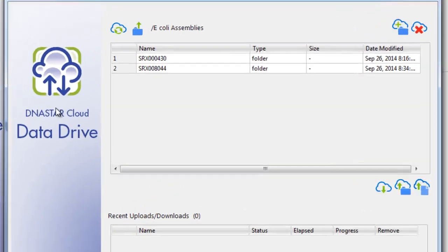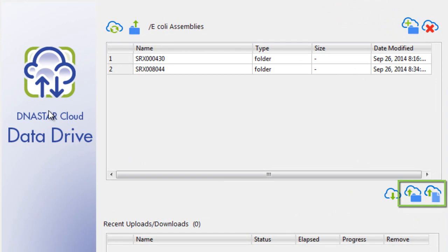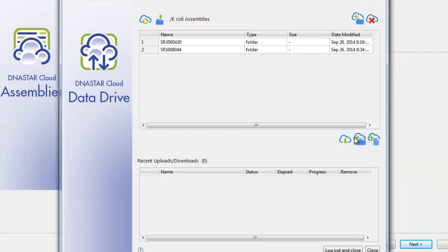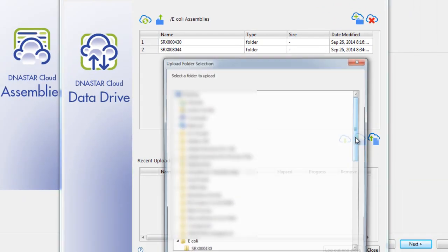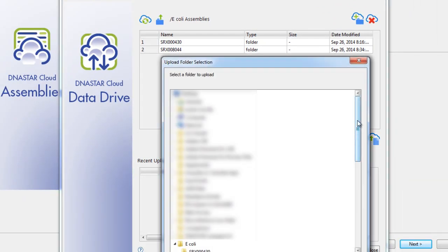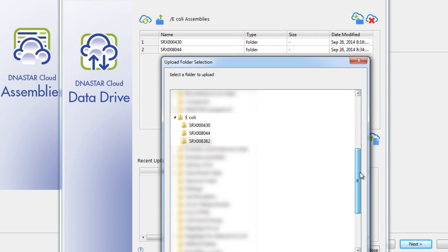To add in data, I can either upload a folder or file. Here, I'll upload a folder holding some FASTQ files from another E. coli strain.